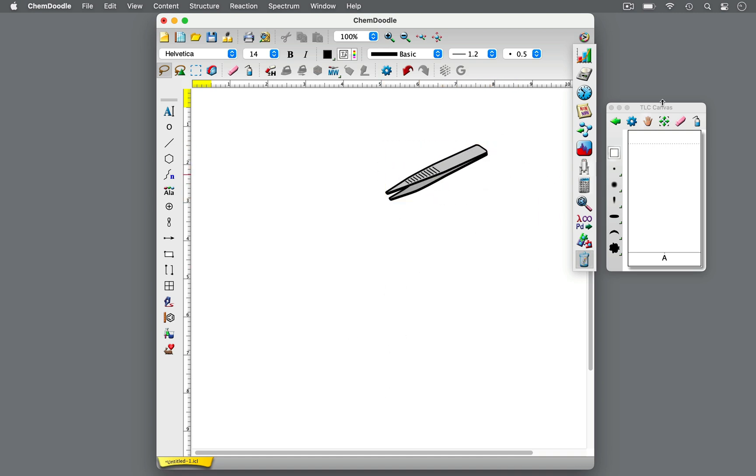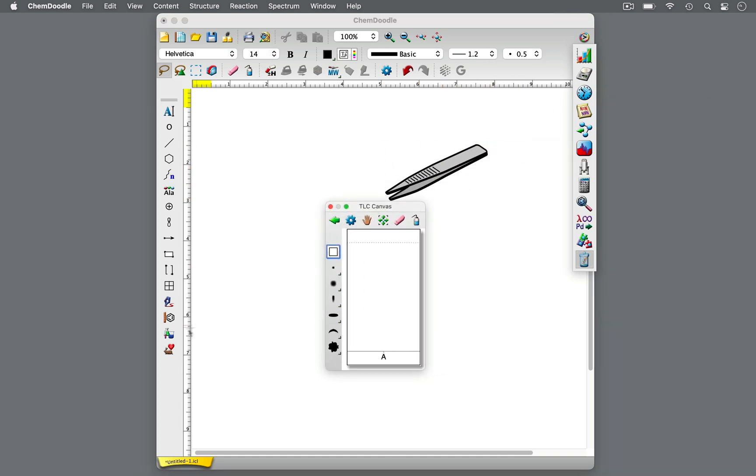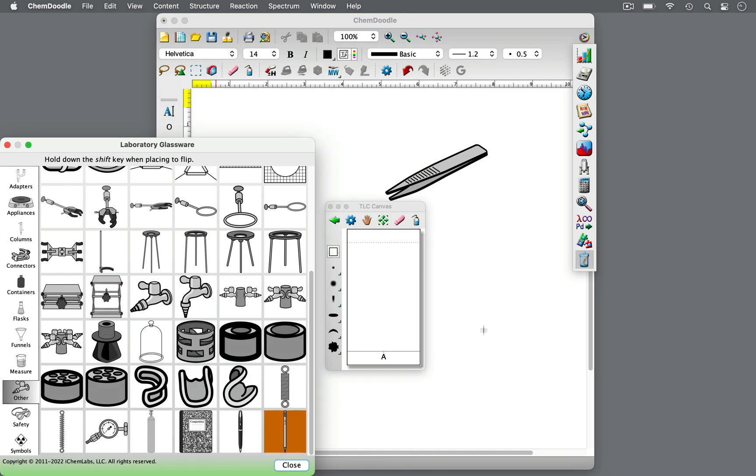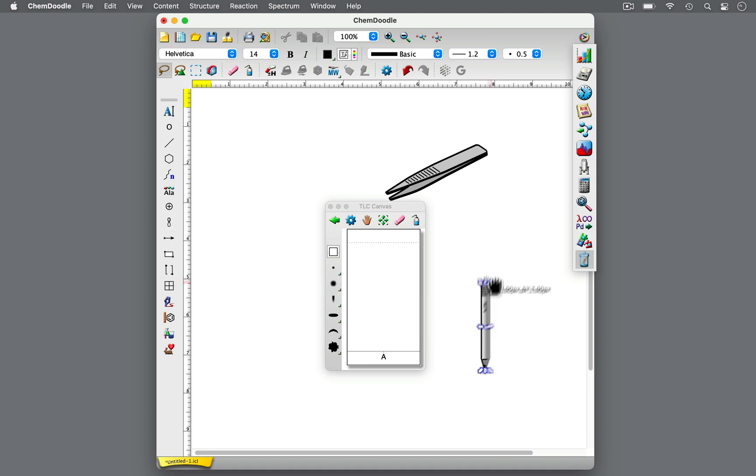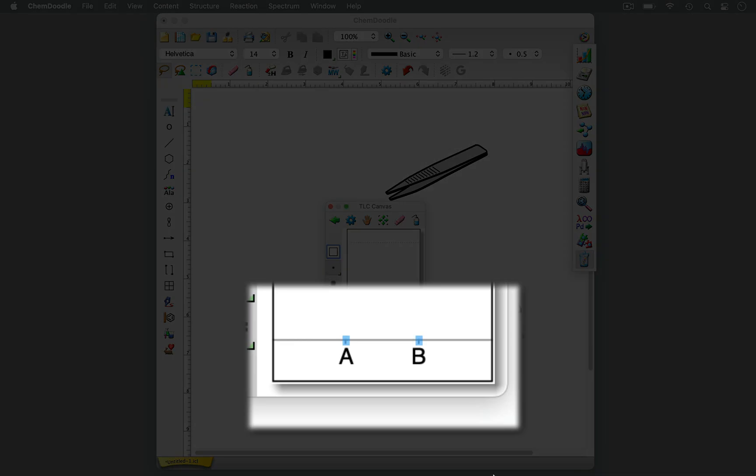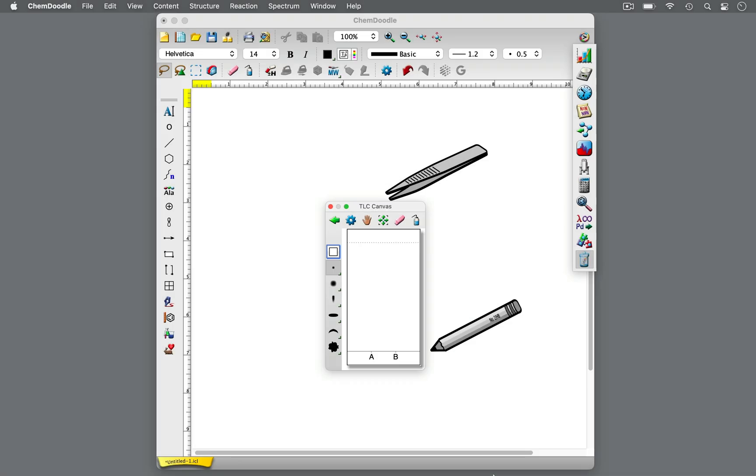To prepare a TLC plate, draw a horizontal line about 1 cm from the bottom. Be sure to use a pencil. This will be the starting point of the samples. Then, draw small ticks along the horizontal line to mark the placement of each sample. Be sure to mark gently so that the stationary phase is not scratched off. Also, be mindful to only use a pencil, not a pen, as pen ink can elute with solvents and interfere with the development of the samples.